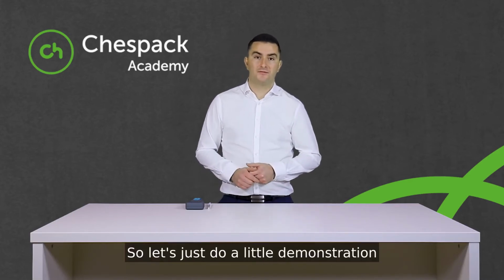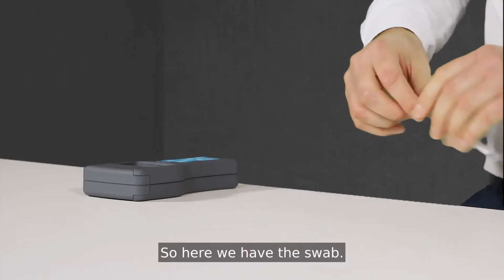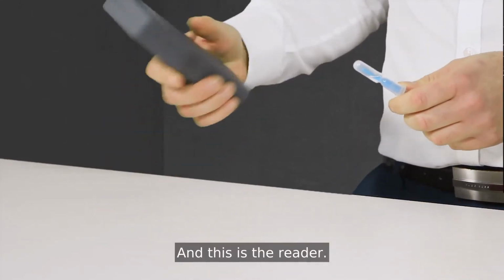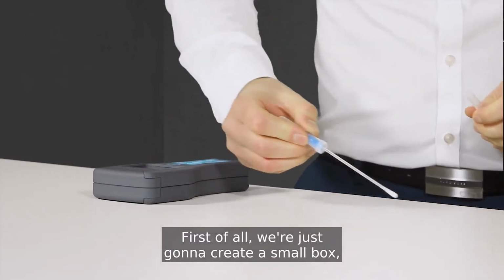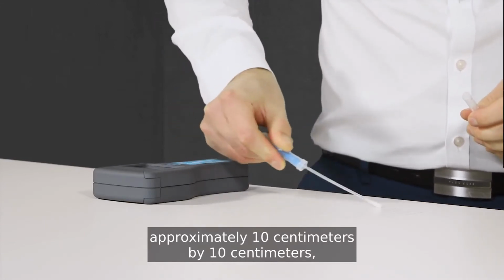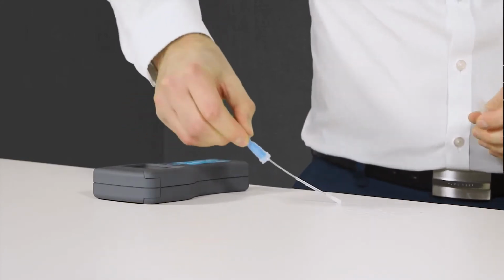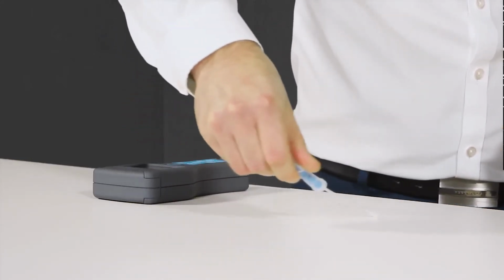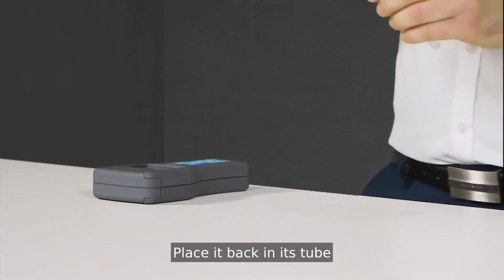So let's just do a little demonstration just to illustrate this. So here we have the swab, and this is the reader. First of all, we're going to just create a small box, approximately 10 centimeters by 10 centimeters, using the swab, and then back the other way. Place it back in its tube.